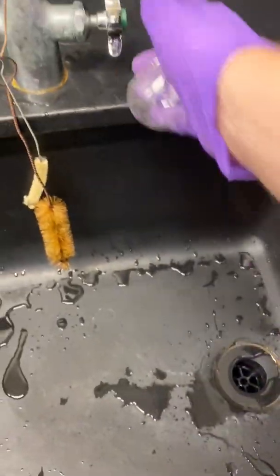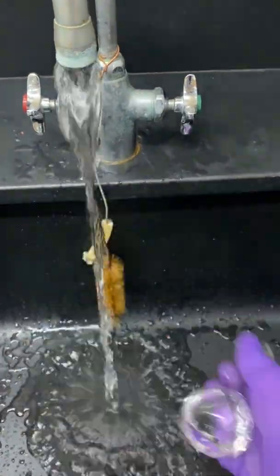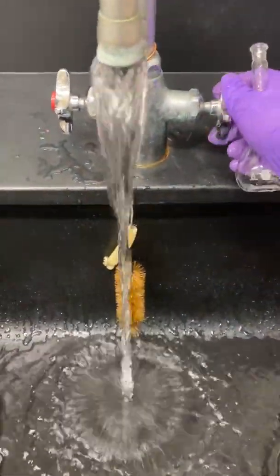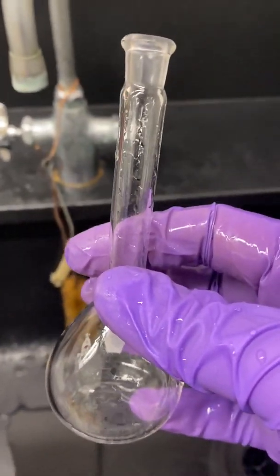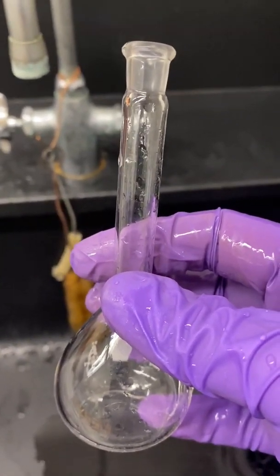Clean out your volumetric flask in the sink, wash it, and prepare it for the next solution. You do not need to dry the volumetric flask because you're always going to be filling it to the mark with distilled water. But it is important to wash it well so that you don't have any residual orange color from the first solution.